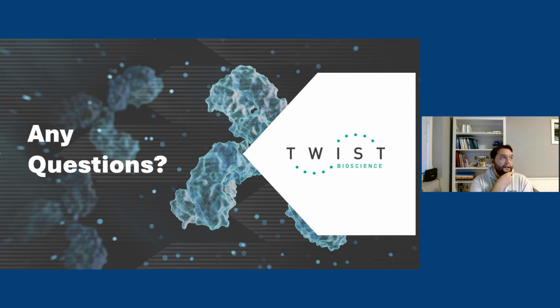What makes it precise? There are, of course, explanations. Maybe the question is why this is working. Well, there are many reasons for that. First of all, in each iteration, in most cases, you're dealing with a low data regime, right? Around that seed molecule that we want to improve, you don't have that many data points. And what Lab in the Loop helps you with, of course, you don't expect to immediately design the best antibody. That's why we run this iteratively, right?